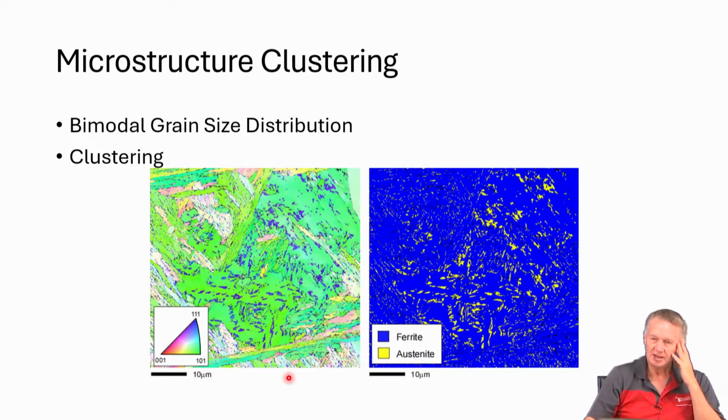So there are 2 bands that are shared, right, between the FCC and BCC if we just look at the 4 lowest order, the 4 lowest index bands. So 2 are shared and 2 are different of the indexing bands that we're going to use. So they do overlap in some contexts, but typically, which I'm sure you know, it does a very nice job of distinguishing between FCC and BCC. And you can look at just the confidence index within each individual phase.